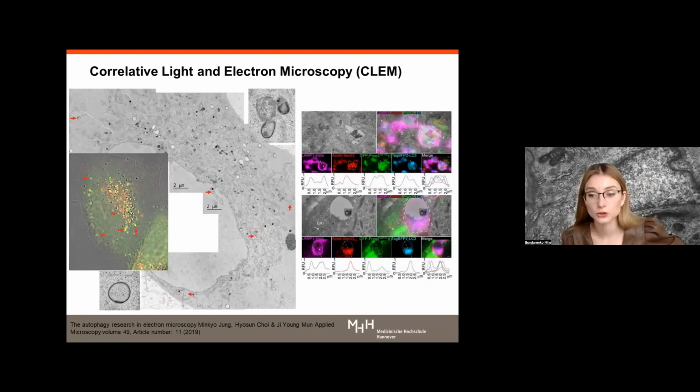a variant of electron microscopy, also brand new, is the correlative light and electron microscopy method that combines light microscopy with high resolution electron microscopy. The combination of the various labels used in light microscopy imaging with the nanoscale high resolution structure provided by EM makes correlative microscopy superior for morphological studies of different types, in this case, once again, of autophagy.